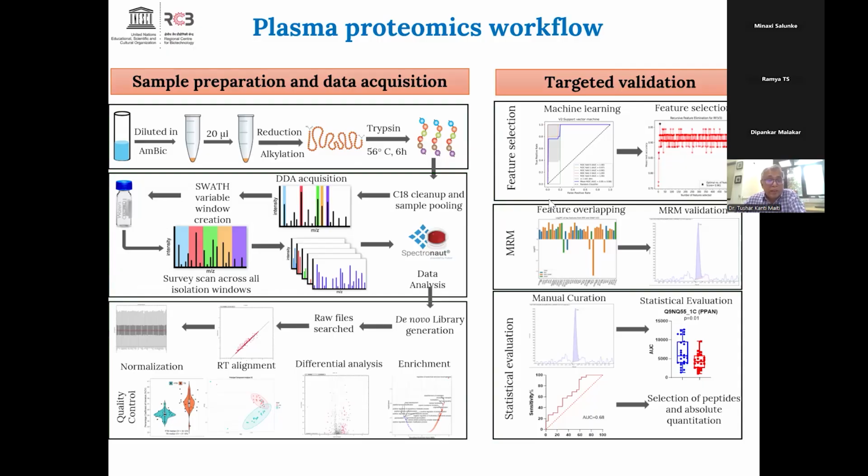At the same time, this data is also analyzed in Spectronaut, and then we performed different types of feature-based selection algorithms and correlated the differential proteome against the feature-based selection method. From that, we selected the hit proteins, or our targets of interest.